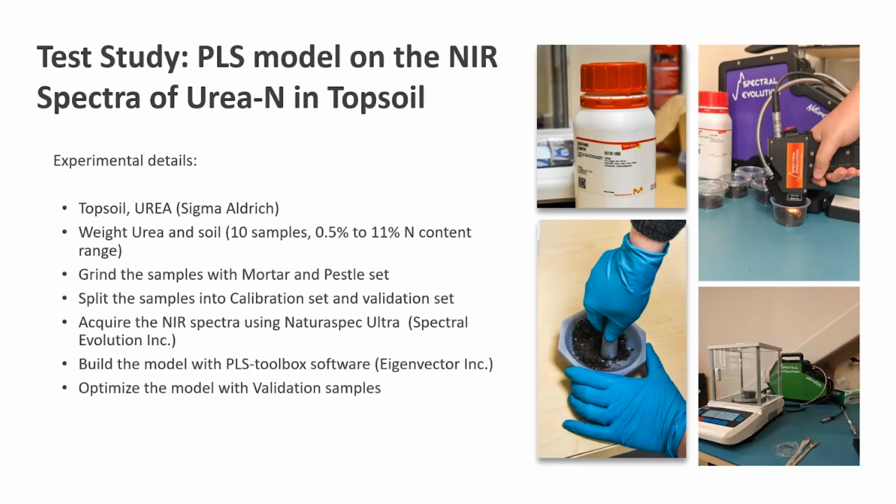And the higher resolution instrument that you use for these kinds of analysis, the better their performance on the actual nitrogen content should be. And that's because with higher resolution, you should be getting closer to the real reflectance and not smoothing anything out based on that full width half max spectral resolution.